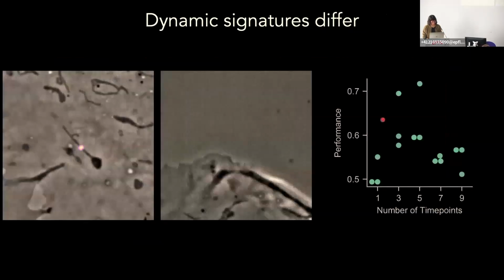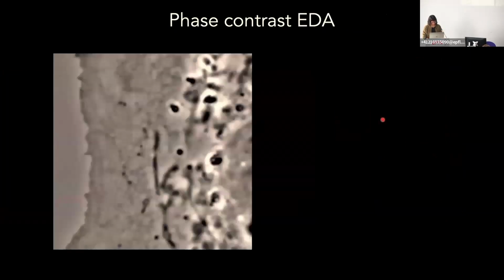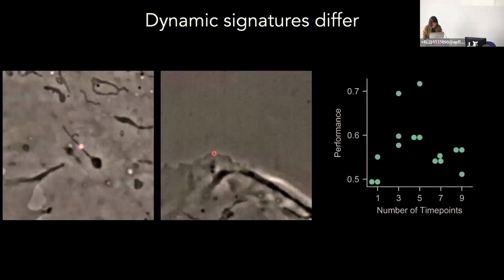So from frame to frame, in one case, you get this division and bouncing back of the two parts of the mitochondrion. And in the other case, maybe it's not playing. It is much less dynamic. These cell membrane ruffles, they last a long time. And so what we've been doing is to introduce time in different ways into our detection system.